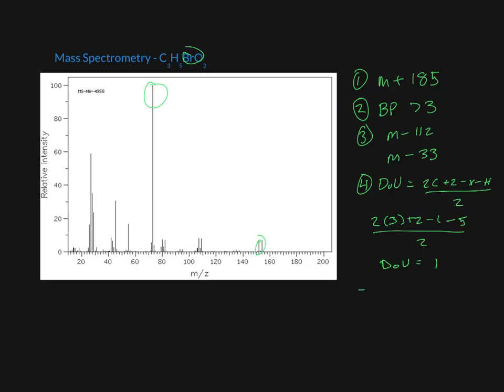And lastly, we move on to identifying any halogens that we have in our formula, which we do have a bromine.